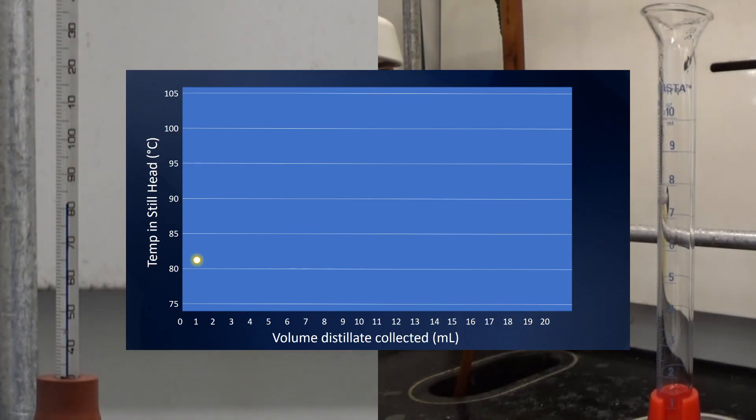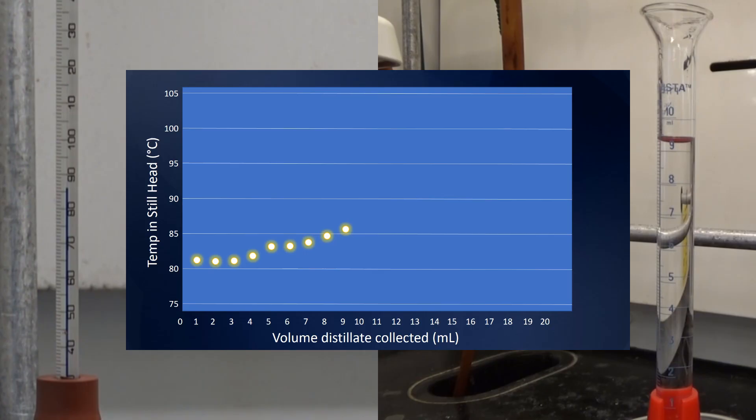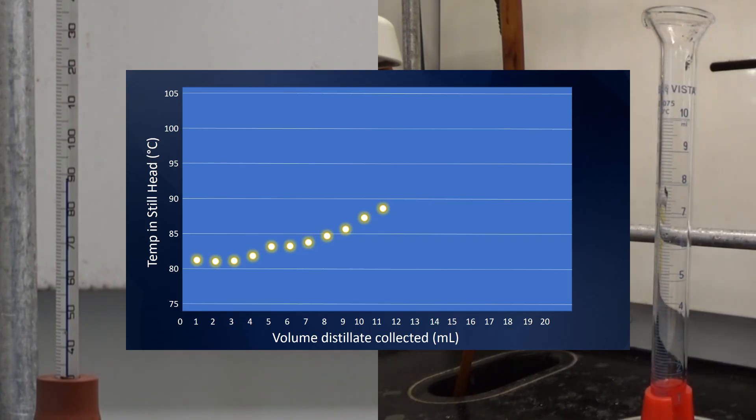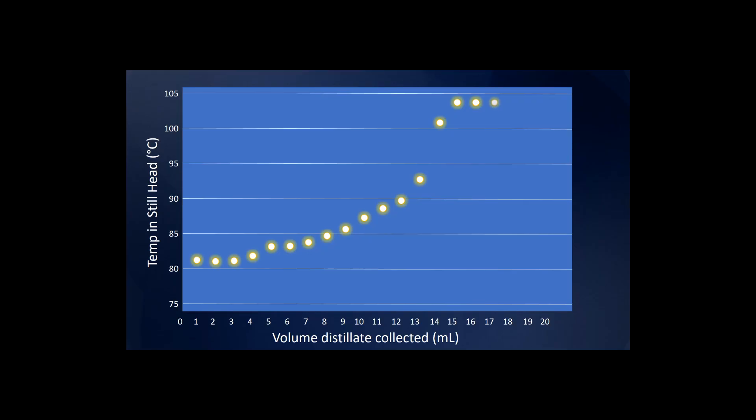If you watch carefully as this procedure continues plotting the temperature in the still head as a function of the amount of distillate collected you may notice that over time it slowly increases. This is because the temperature within the still head is essentially the boiling point of the distillate and since I'm running a simple still which is not capable of achieving a great separation, the composition of that distillate is slowly changing. After a significant period of time you may actually notice that it eventually levels off. This is because all the ethanol has been removed and we're just distilling water at this point. So once we get to about half of the total volume that was added to the flask we can get a few data points that show us that we have arrived at that point and then we're ready to stop.